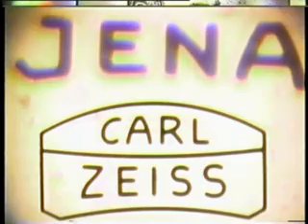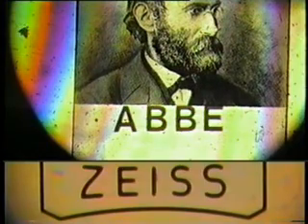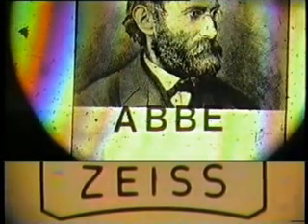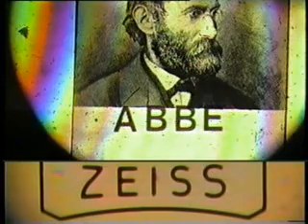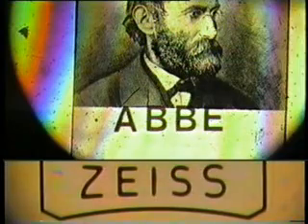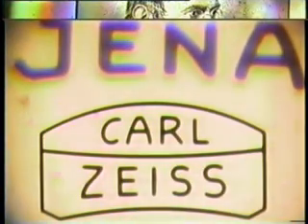If I move now to the back focal plane of the objective, you'll see, as I said, that Abbe's picture is in the back focal plane, but his name is somewhere else. I've put that in a conjugate plane, namely in the first focal plane of the condenser. I'll be putting various diaphragms into the first focal plane of the condenser. I'll be putting other things in the back focal plane of the objective as time goes on, and we'll be having a look at the effects of those on the final image, which occurs at the bottom.